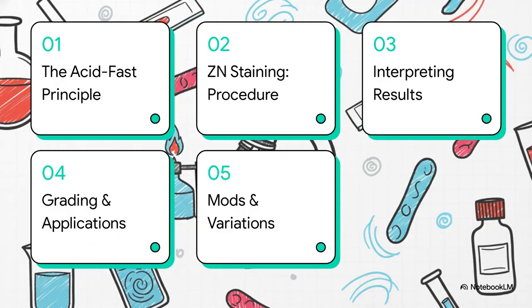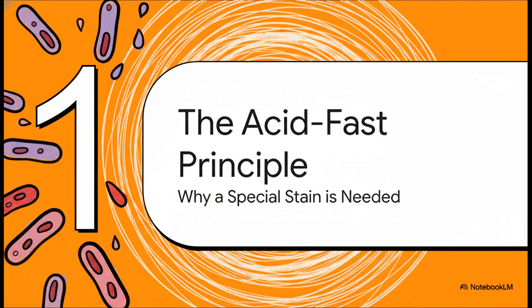So here's what we've got on the agenda. First, we'll cover the why, the whole acid-fast principle. Then, we'll jump into the procedure, step by step. After that, we'll figure out how to interpret the results, see why it's so important in the clinic, and wrap up with some key modifications that are super high yield for your exams. Sound good? All right, let's start at the very beginning.